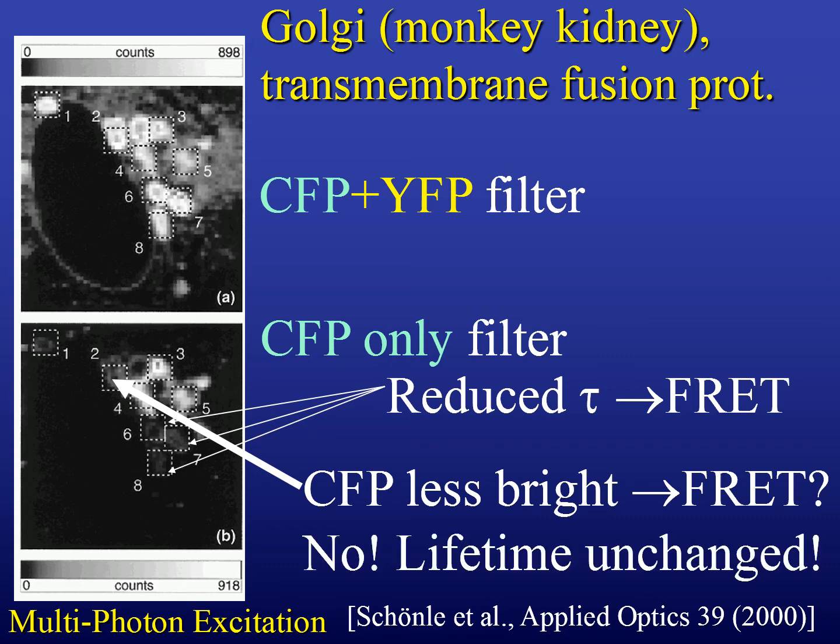Not only could the lifetime be changed, but most importantly, you can have, of course, brightness changes of species simply by their relative presence being different. And so if you look here, then there is no change actually of lifetime if you measure here, whereas the brightness is clearly different. And in these ones, you have a reduced tau, which indicates that most probably there's Förster transfer going on.